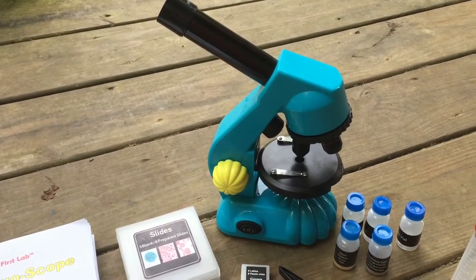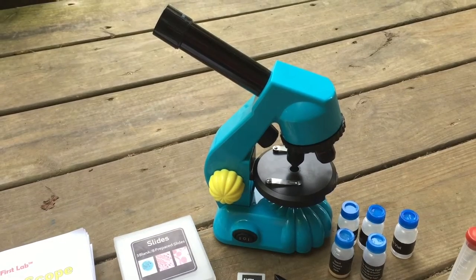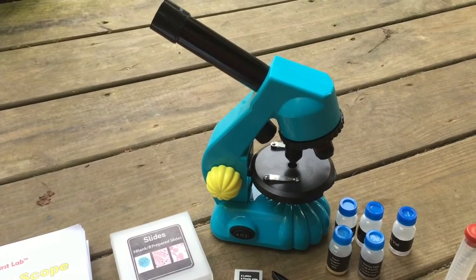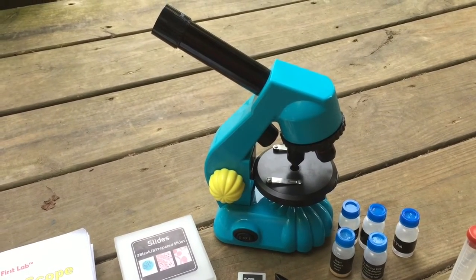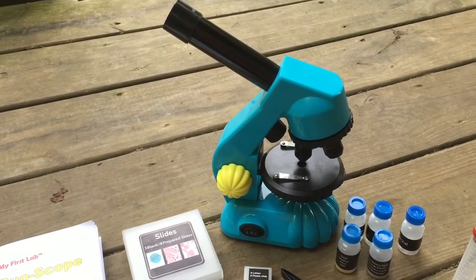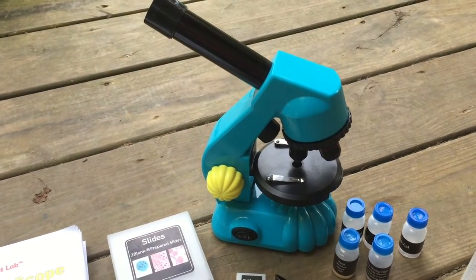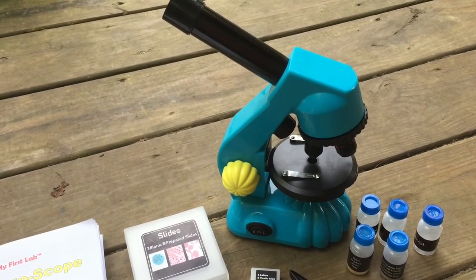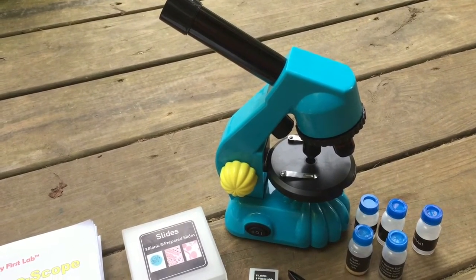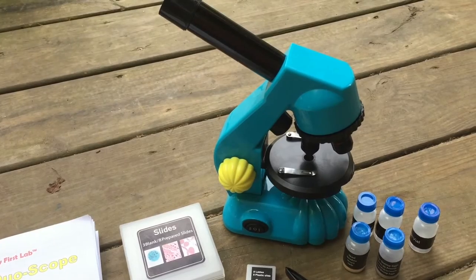When you start researching something like a microscope, even though this is technically considered a toy microscope, I wanted to get reviews from microscope reviewers because I don't want something that's just a toy that the boys can't really get the benefits from. All the reviews I read were fantastic. The only difference between this and the duoscope is this one's a little bit smaller and has all plastic parts — even the lenses are plastic — but based on all the reviews the plastic lenses only lose a little bit of quality, not enough to make a difference. This goes up to 400 times magnification, which is not typical for toy microscopes at all.